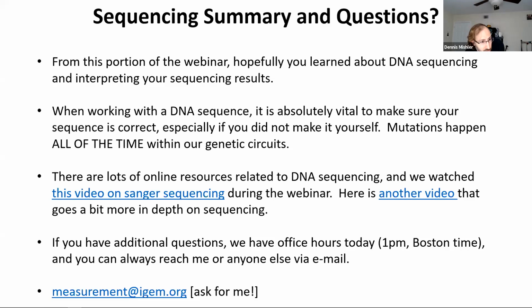Great, good. I'm going to skip a couple of these questions just because of time. Nanotech, sure, you can use nanotech with DNA sequencing, totally agree. For transformations, are you sometimes using transfection via liposome? We don't. We only work with bacteria. But yes, people with mammalian cells, absolutely. With mammalian cells, yes, you got to do stuff like that.